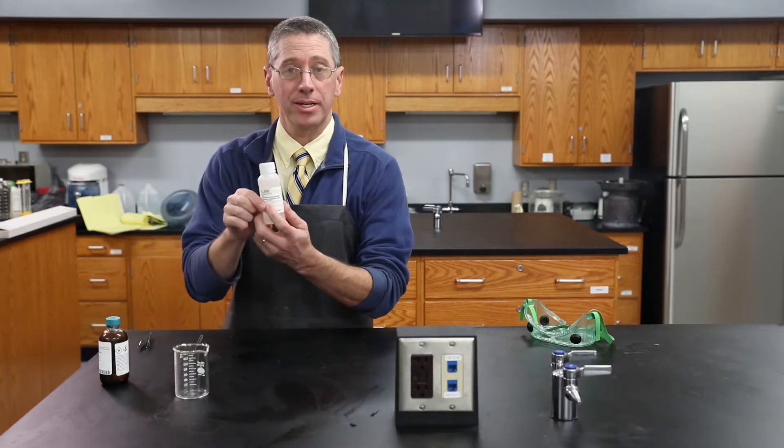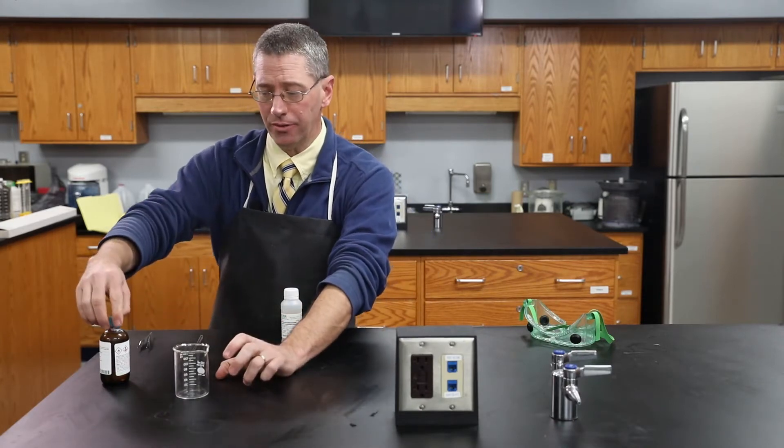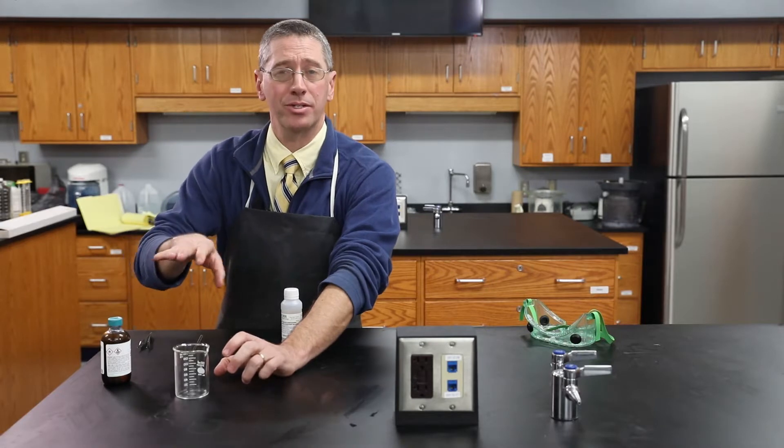I'll pour the first hexamethylenediamine into the beaker, then I'll tilt the beaker so that I can carefully pour the sebacoil chloride on top of it.